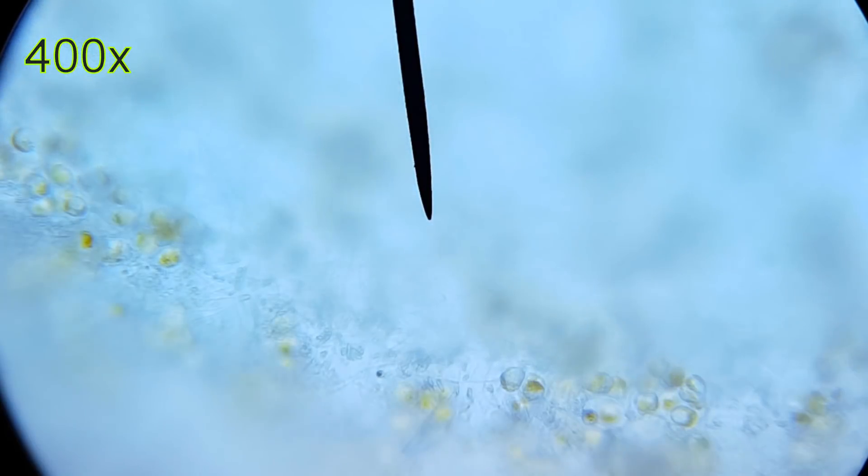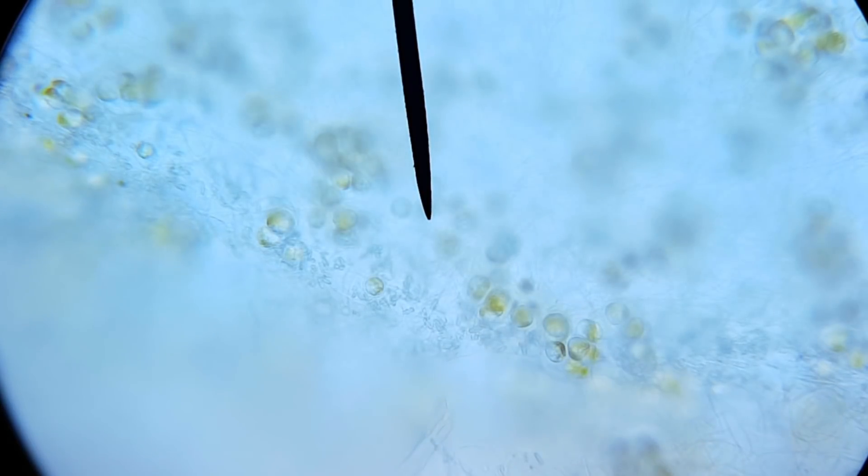I'm also going to take a look at a piece of algae from the glass, to see if there's any difference. It does look a little different, but let's move to a less pleated area.